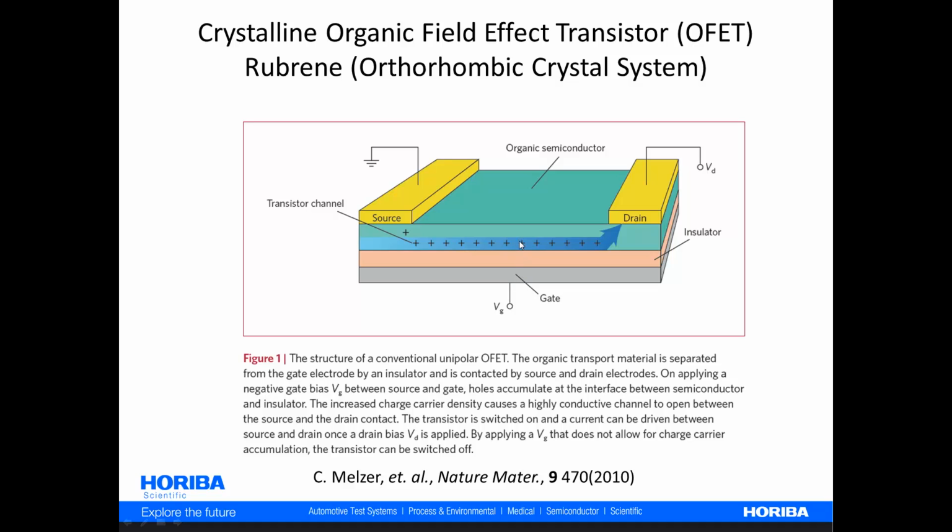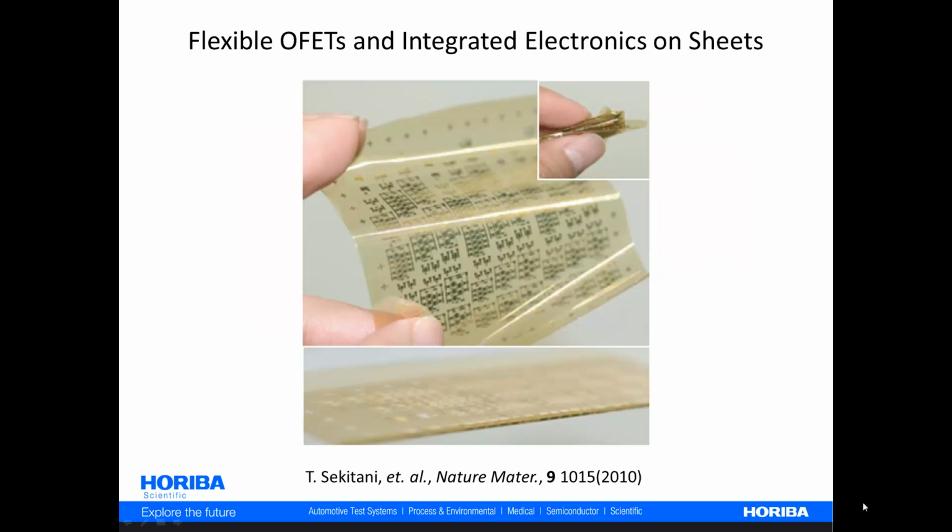What's different in the case of an organic semiconductor is that we're essentially replacing silicon, which is ordinarily doped with N or P-type dopants, with an organic semiconductor, and generally speaking it's crystalline. Today we'll discuss the results of micro Raman spectroscopy of rubrene grains taken right out of the reagent bottle.